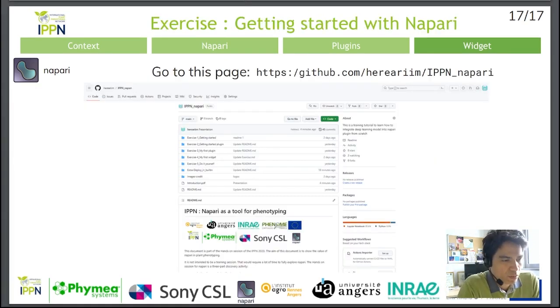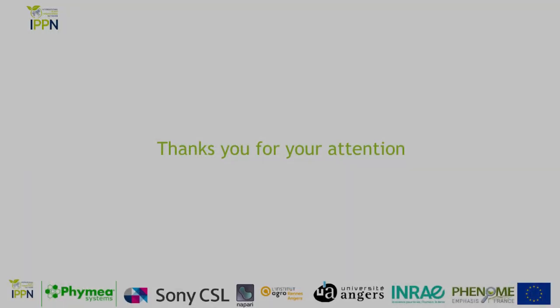This video is now complete. In the second part, we will get started with Napari. We are going to design and develop a plugin through a number of exercises on the GitHub page.